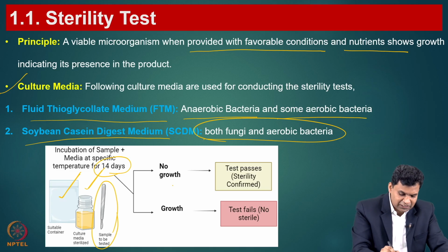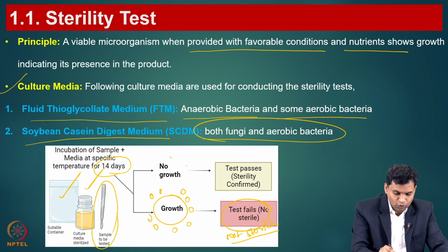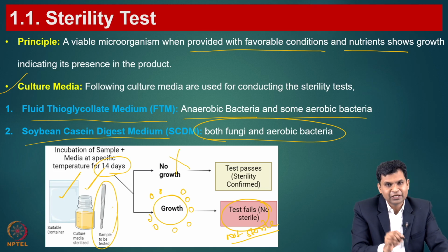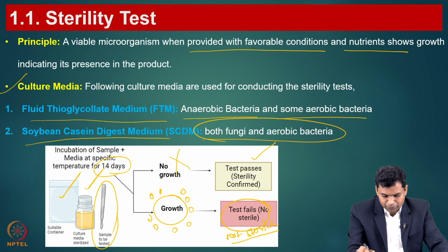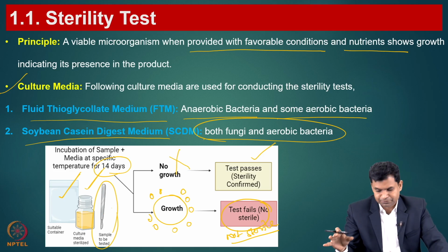After that, if you see any growth in your culture media, that means your product is not sterile, or non-sterile. If there is no growth of microorganisms, that means your product is sterile. We have to remember this general principle.